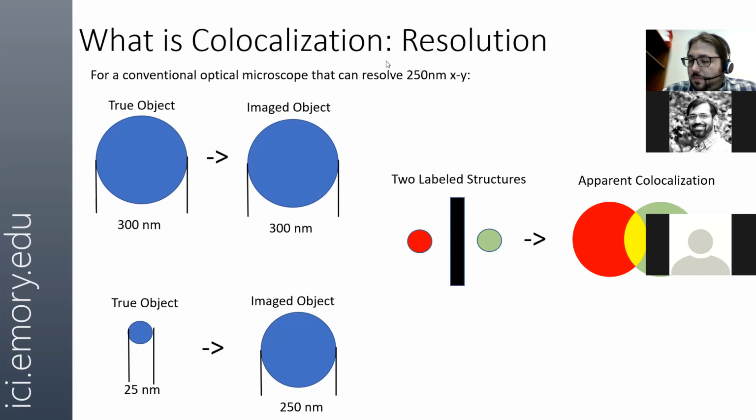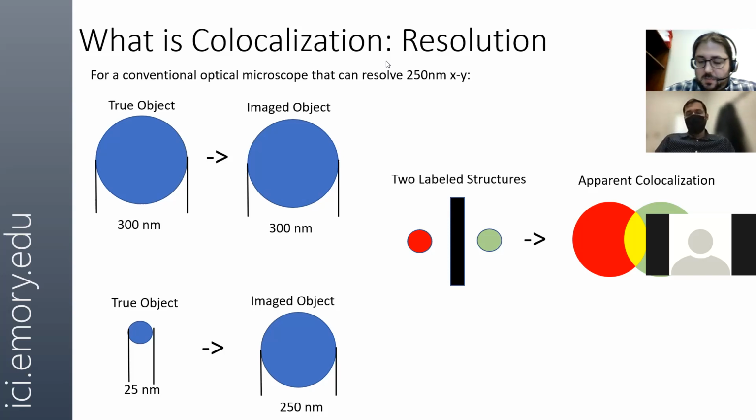Because earlier we just said Pearson's coefficient or something, and then it said, yeah, these two are co-localized. So just giving that is not sufficient, you're saying. Exactly. Pearson's coefficient. Okay.